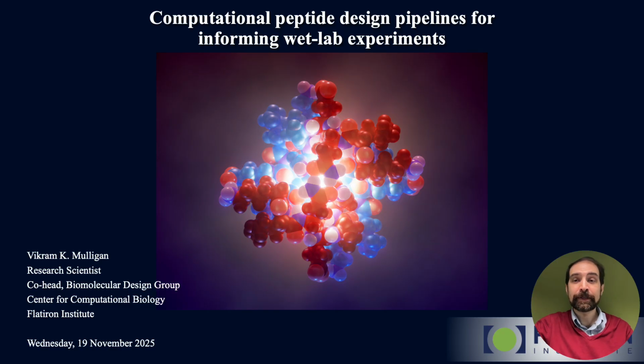And today I'm going to tell you about pipelines for computational design of peptide macrocycle therapeutics that my team has developed and which can inform the wet lab experiments that are involved in discovering a new peptide therapeutic.